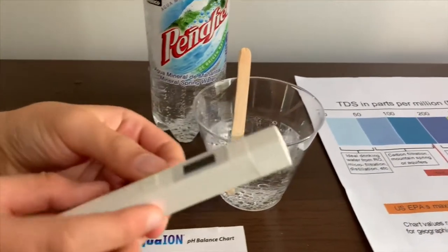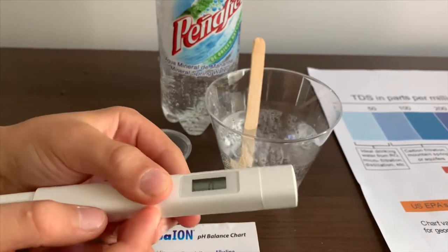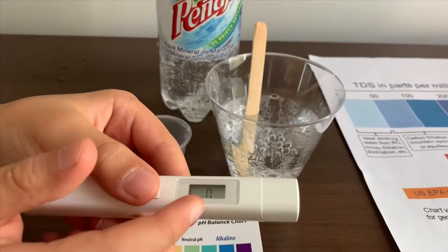If you want to buy this TDS tester, check the link down below. Turn on the TDS tester, make sure it says 0, and put it in.